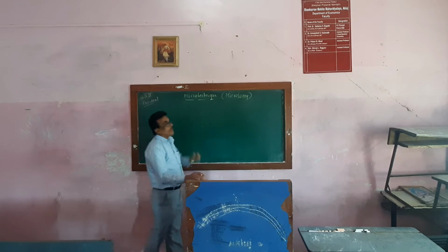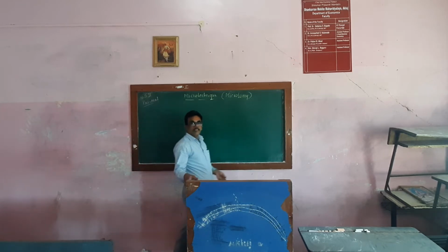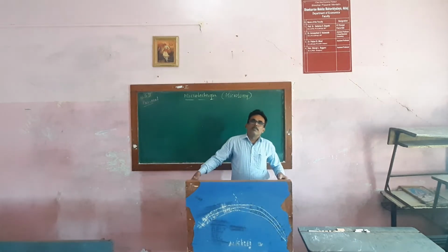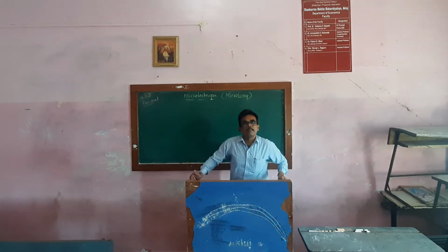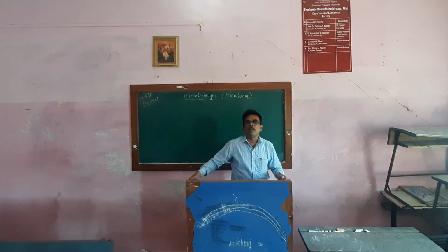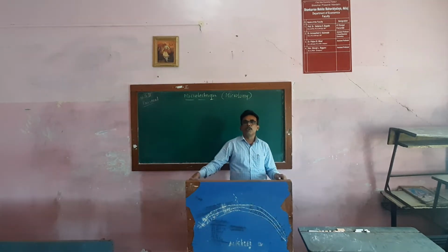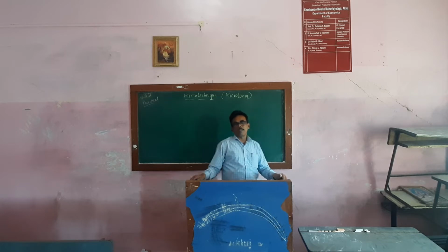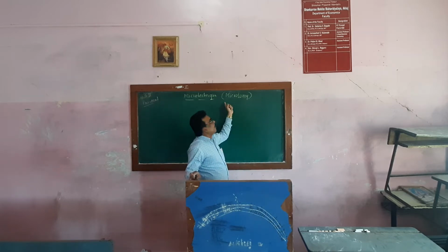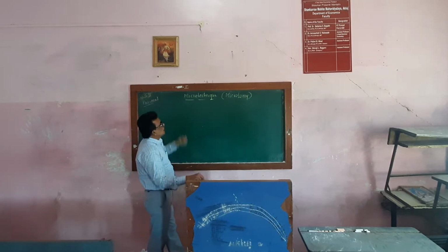What do you mean by microtomy or microtechnique? Microtomy is nothing but the technique by which slides are prepared, and that is useful for observation of the cells of the body or tissue of the body. So by this technique we can study the particular tissue.